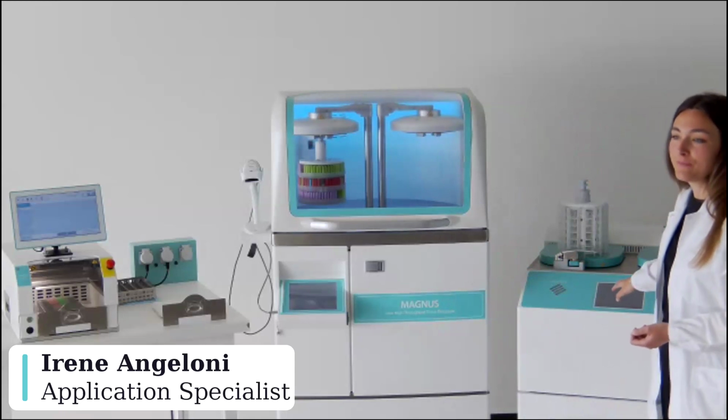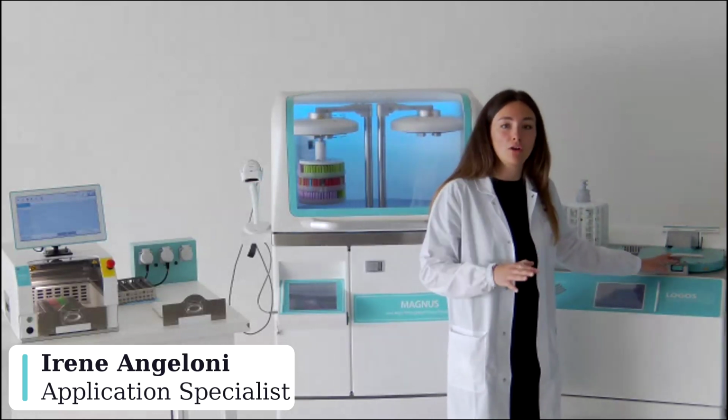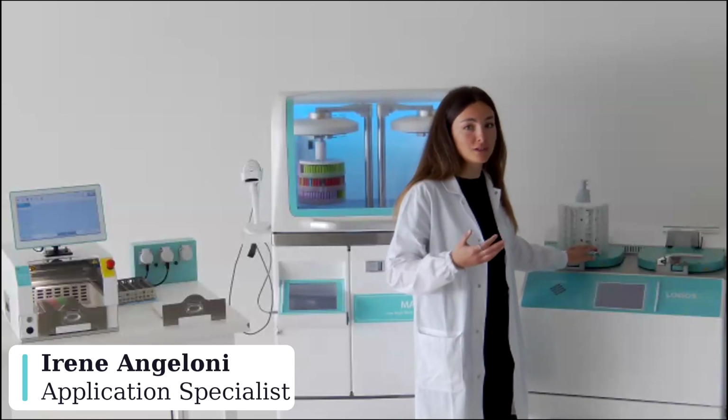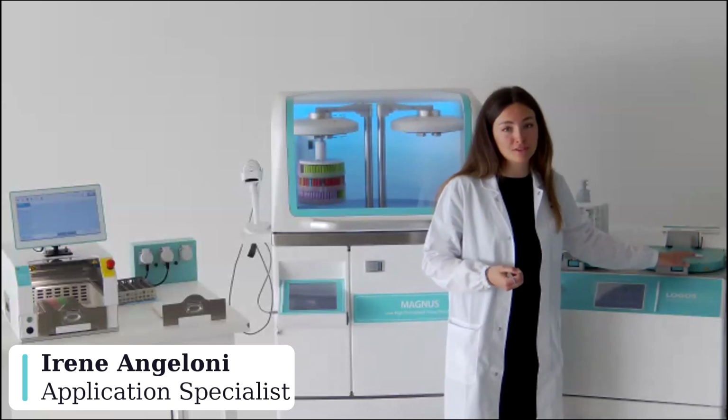With Logos Evo, it's the same concept. We have a cavity for all the reagents and a cavity dedicated only to wax, and we have the possibility, when the technician is present, to manually move the rack from this cavity when all the steps of ethanol, isopropanol, and so on are finished, and move this rack into the wax cavity.